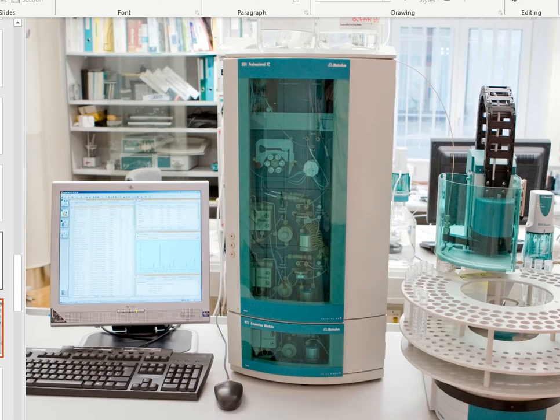This is a see-through door, and you can see the pieces and parts as they work and as they turn without opening the door up. Ours, we don't have a see-through door. Ours is a little older model. Ours is a basic model, not a professional model. What you're seeing here is one that's called professional. This is what they would use maybe in an analytical laboratory somewhere. But what we have does just as good of a job. We might not be able to go to such a low conductivity detection though. But that's what you're seeing there in the screen.